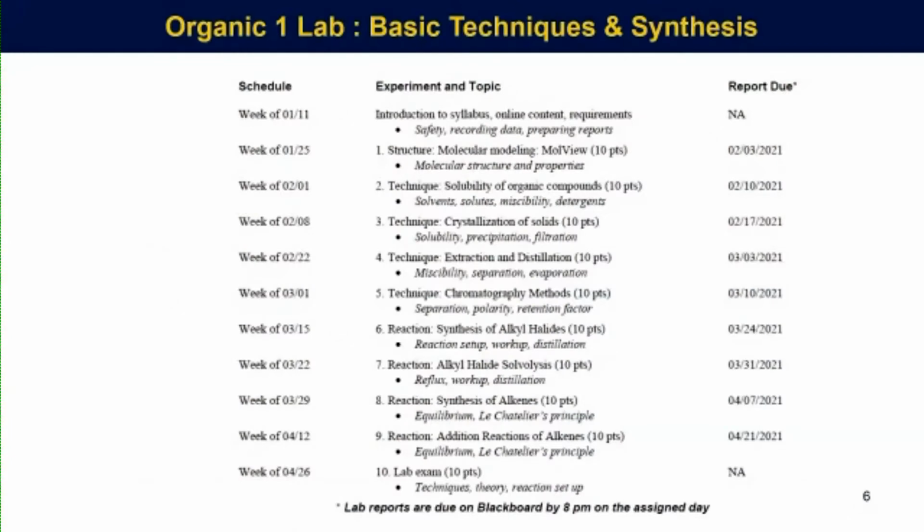So what we tried to do here was set up a sequence as we would in person: learning about techniques, learning about what organic chemistry is about, how do we purify stuff, how do we isolate stuff, and then build up the workflow.